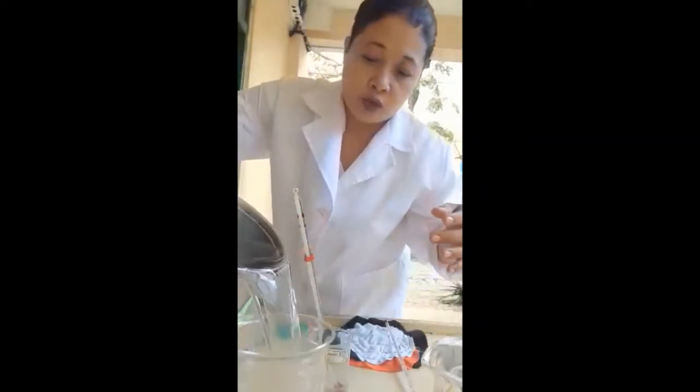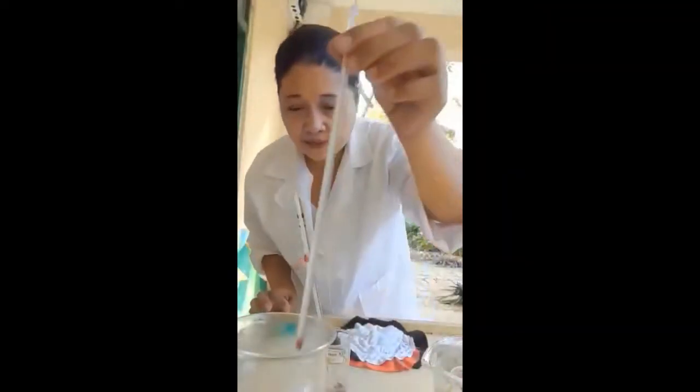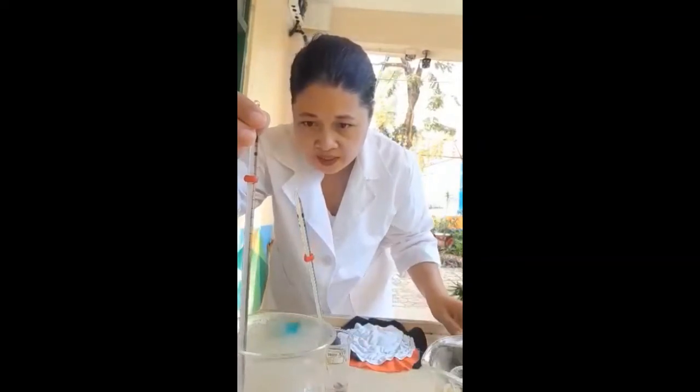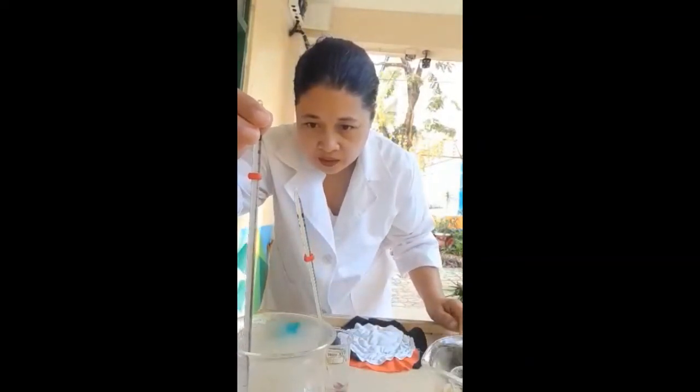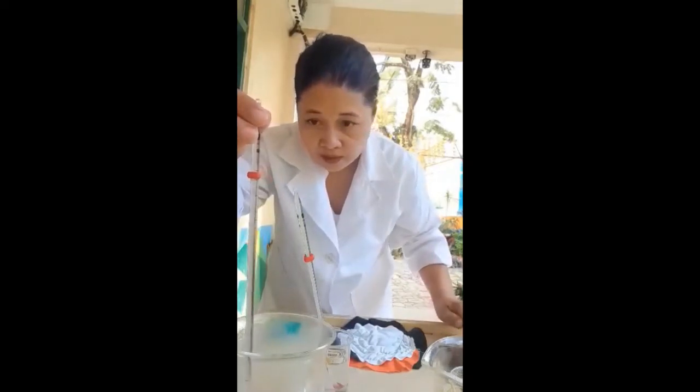So we will try to put the hot water now. Okay. So the temperature now is 75.